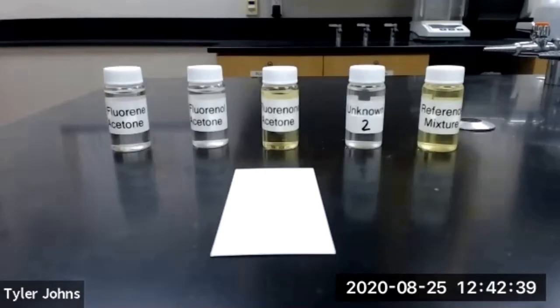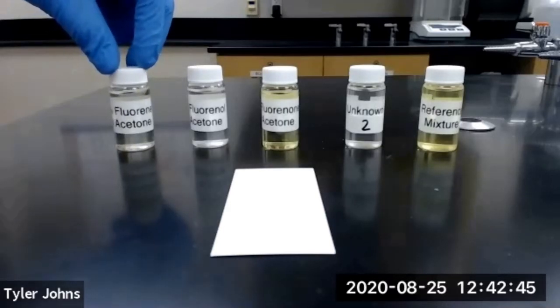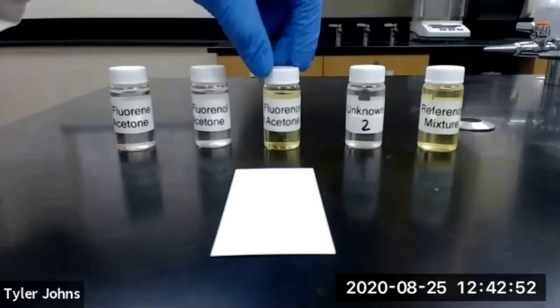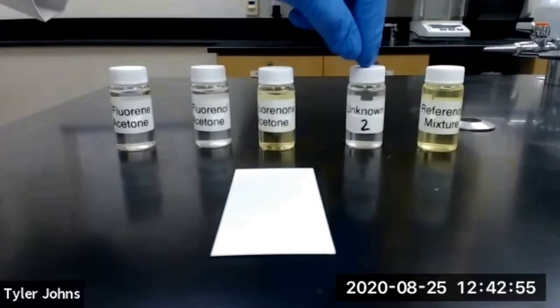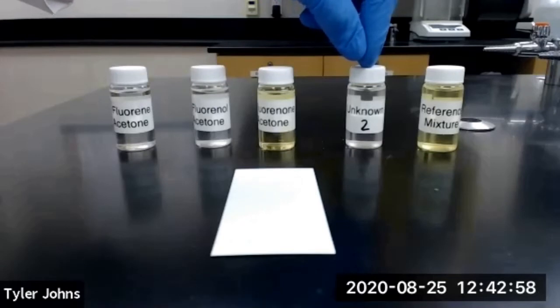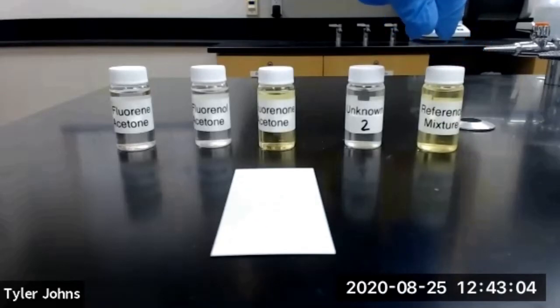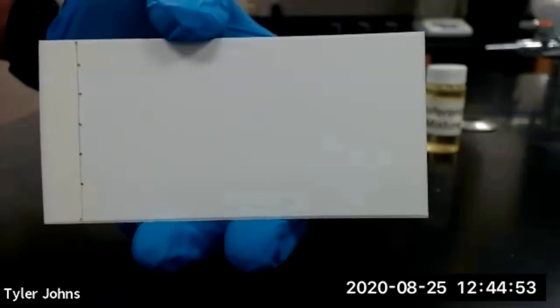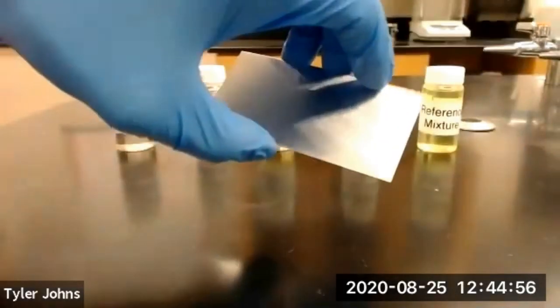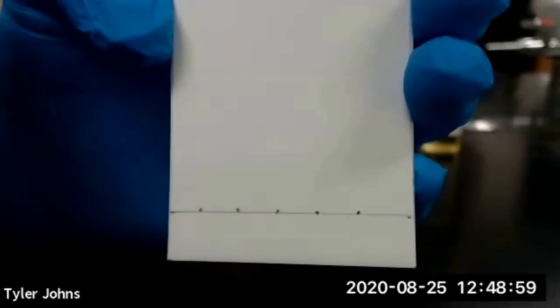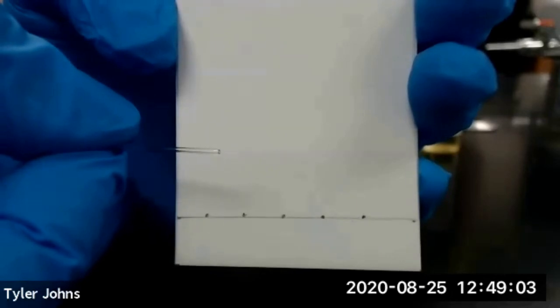We are going to start by spotting two percent solutions of each of our compounds on our TLC plate. We have our two percent fluorene solution, our two percent fluorenol solution, our two percent fluorenone solution, our unknown number two in which we need to identify which compounds are in it, and our reference mixture which contains fluorene, fluorenol, and fluorenone. This is our TLC plate and it consists of silica gel on an aluminum backing. We're going to spot each of our compound solutions one centimeter up from the bottom of the TLC plate using a micro cap or a very thin capillary tube.